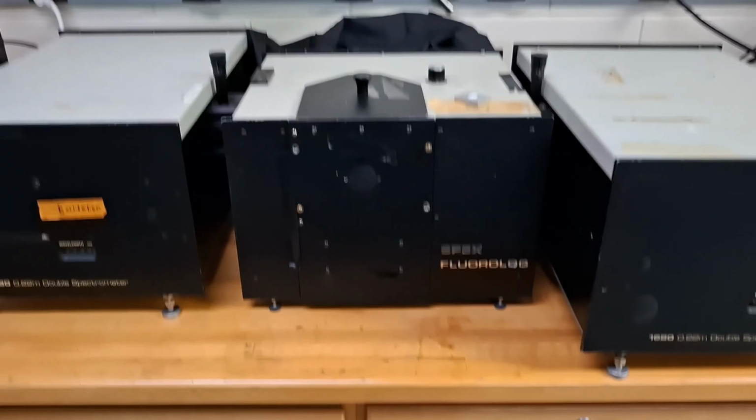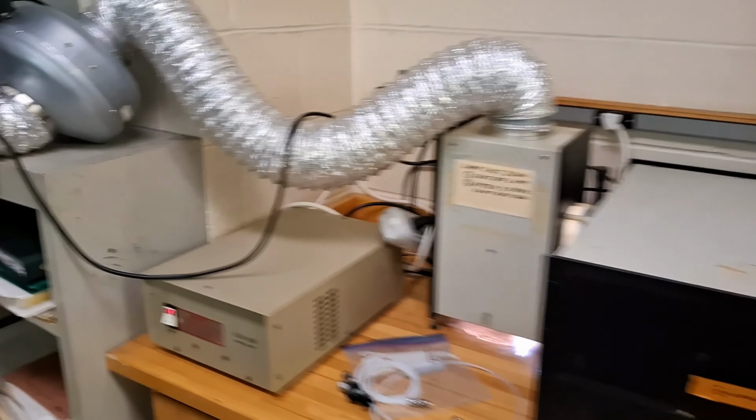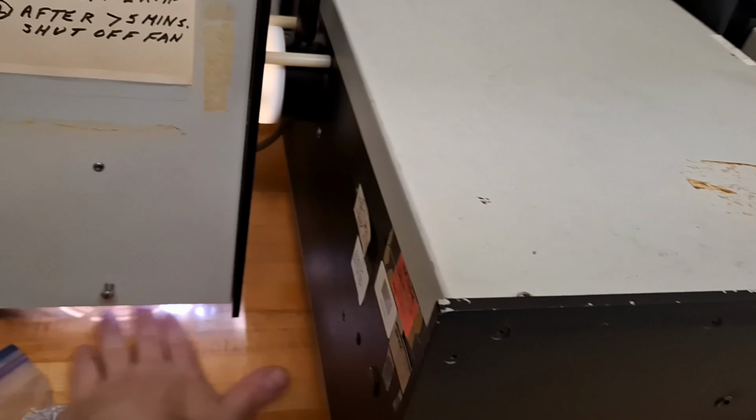Today I will show how to take fluorescence spectroscopy. So this is our instrument. We have a cooling system here. It is working. You can see the UV lights.